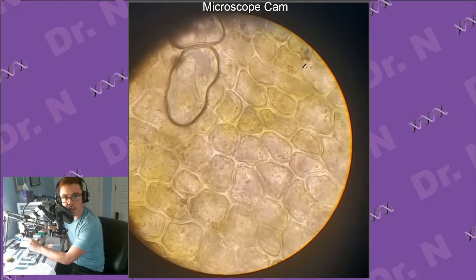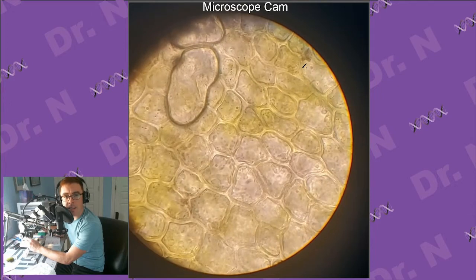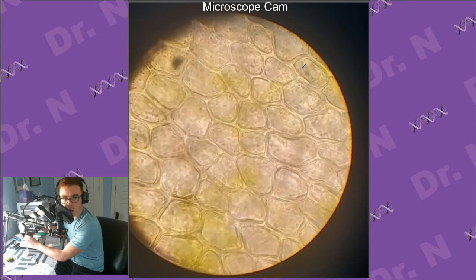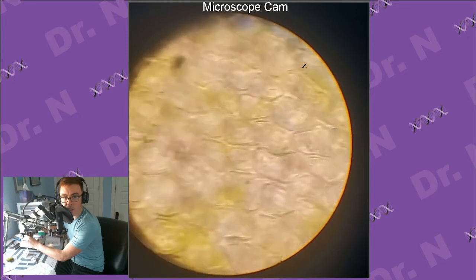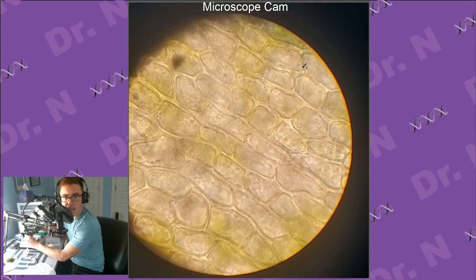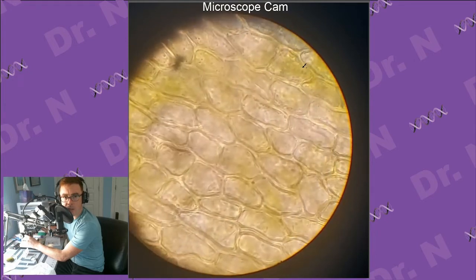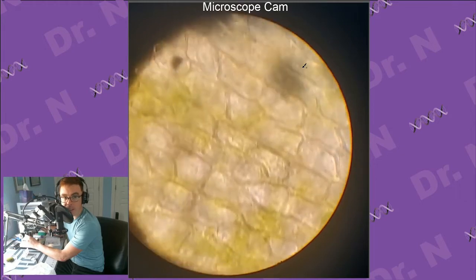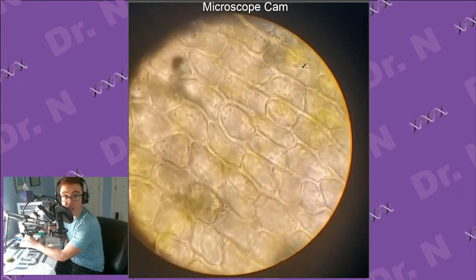But these little dots, little things inside of each of these cells, those look real. I'm not quite sure what they are. They don't look like chloroplasts necessarily. These cells are green, so they probably have chloroplasts. But it might have just been from me squishing it that it looks a little off. I decided to squish rather than try to take a section.